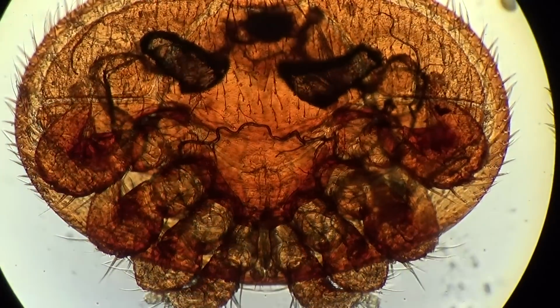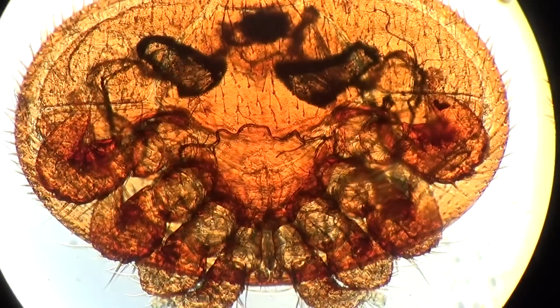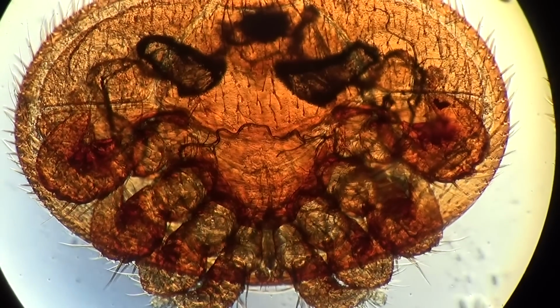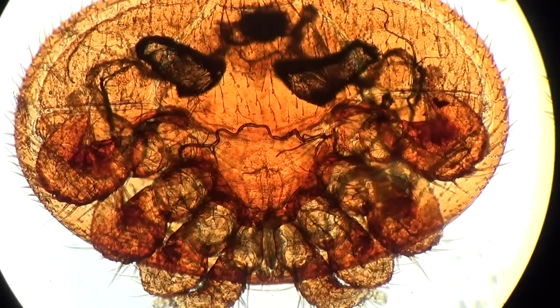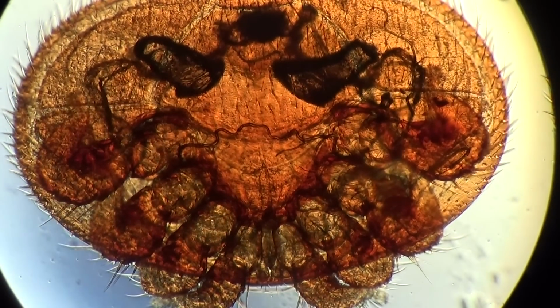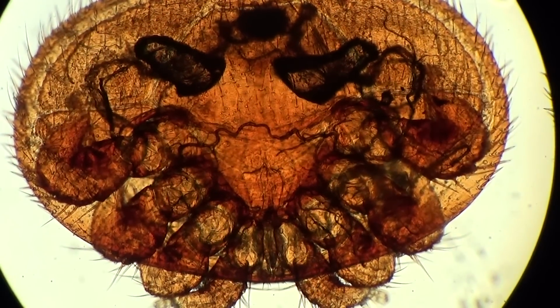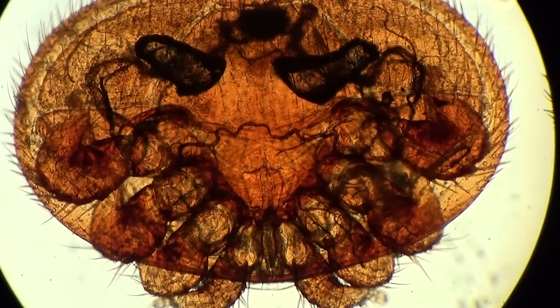And actually this parasite is distributed widely, it's cosmopolitan. You can find it everywhere in the world, except till now in Australia. Even so, it was already found on the Northern Islands of New Zealand. So it's strongly a quarantine subject in Australia and in New Zealand. So you cannot take any material connected with honey, wax or brood to Australia and New Zealand.